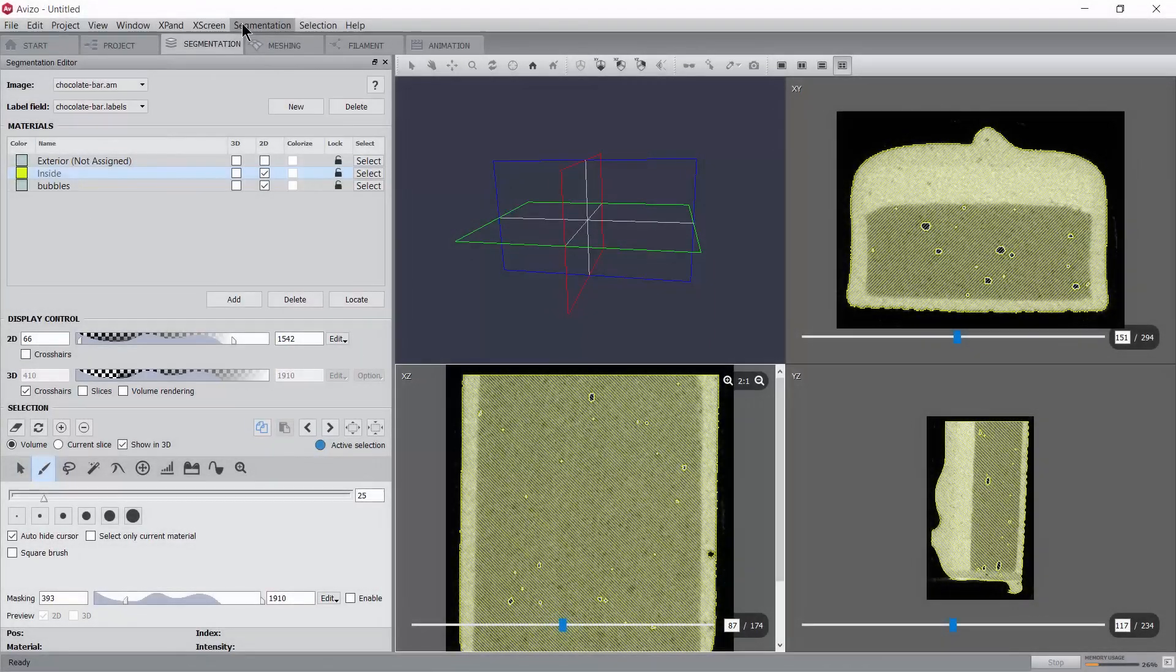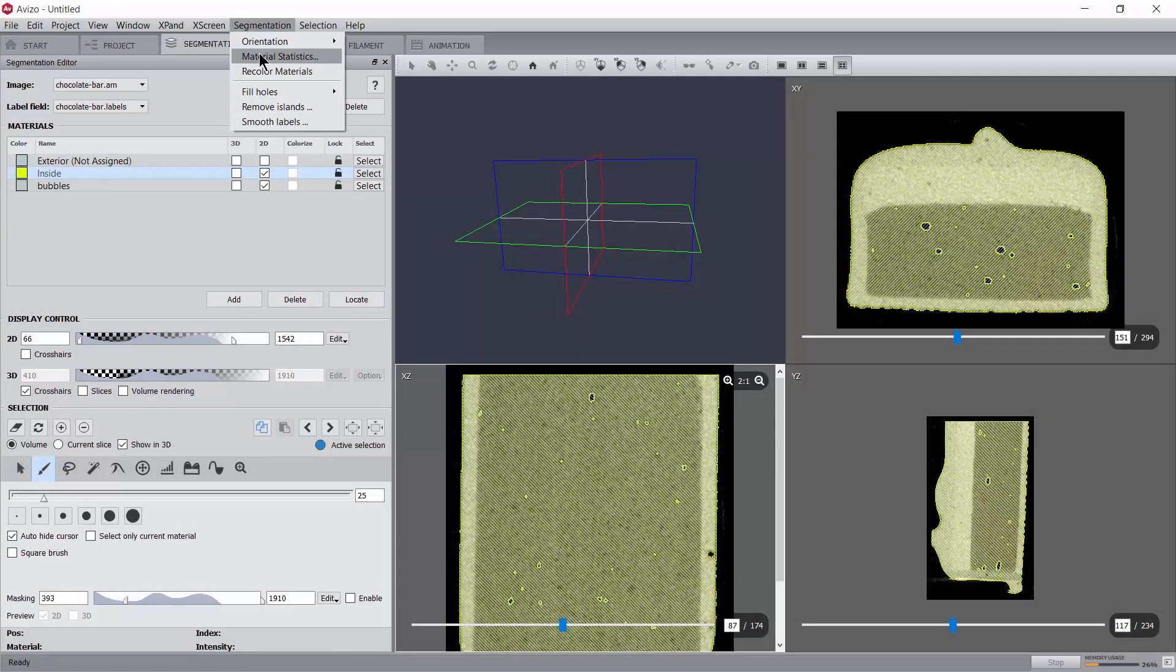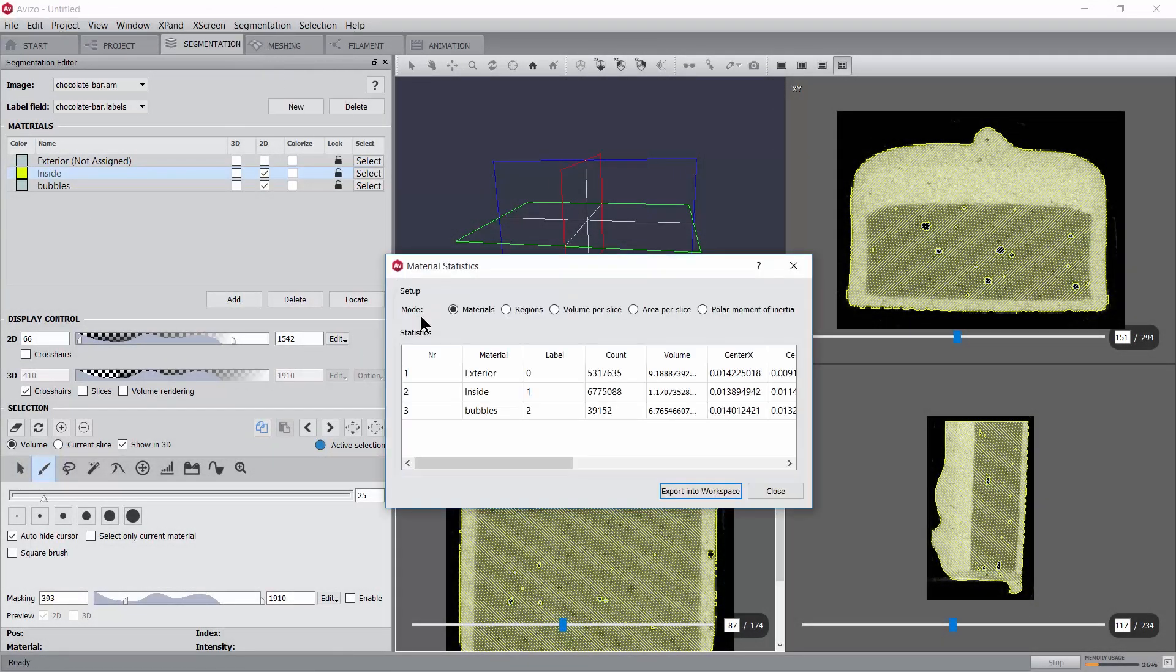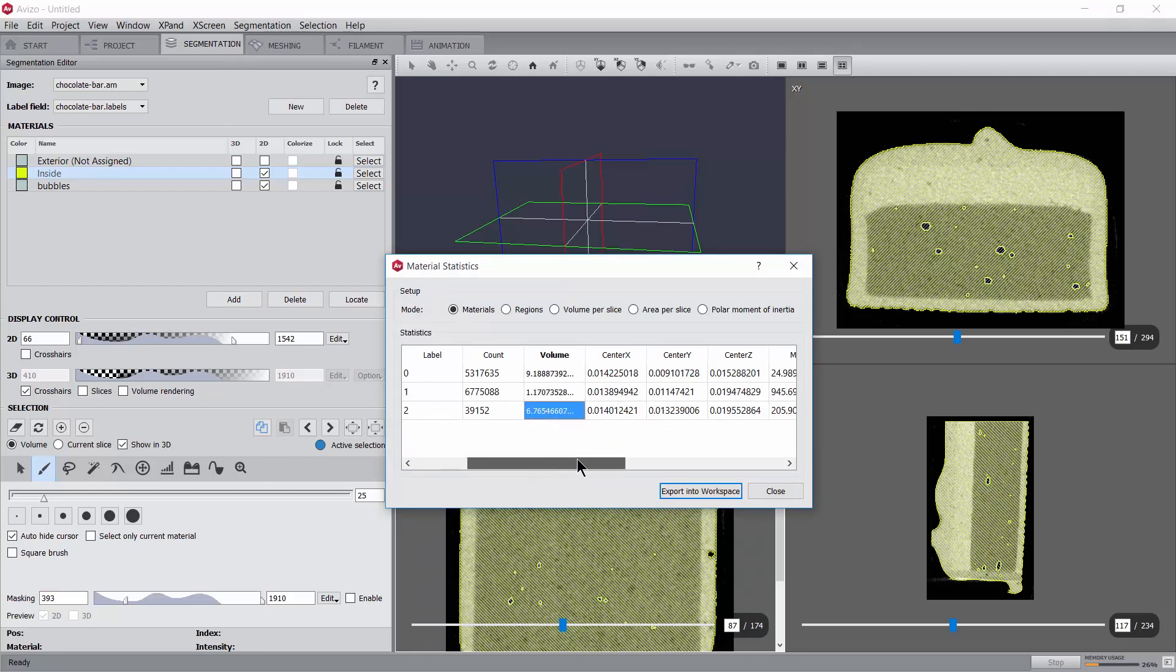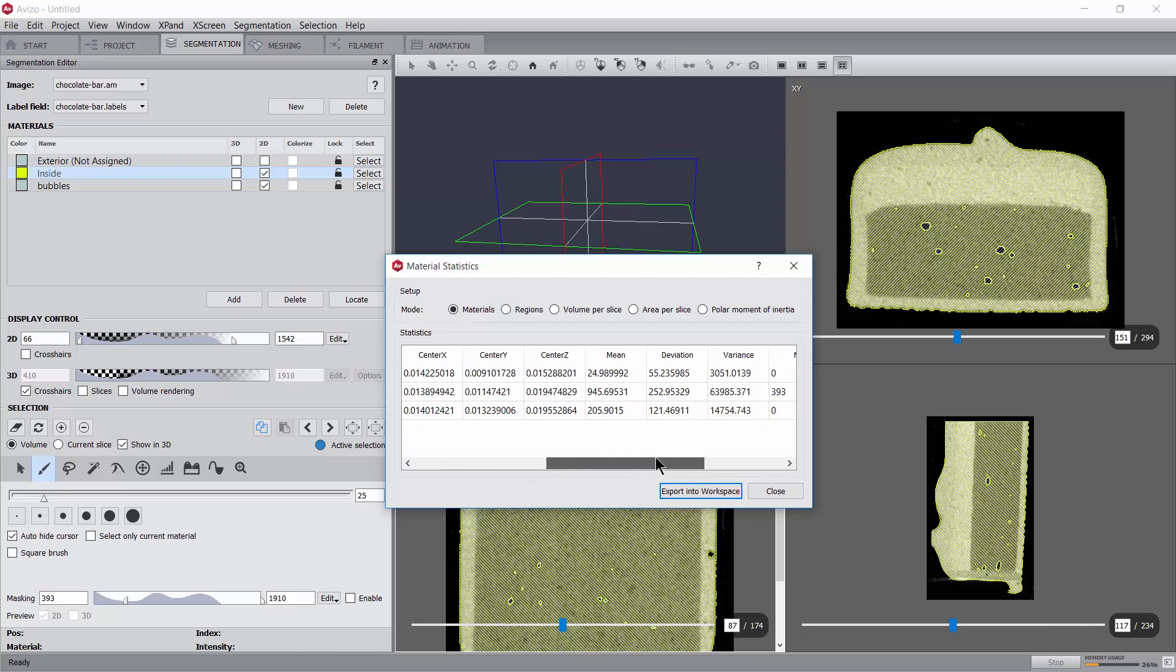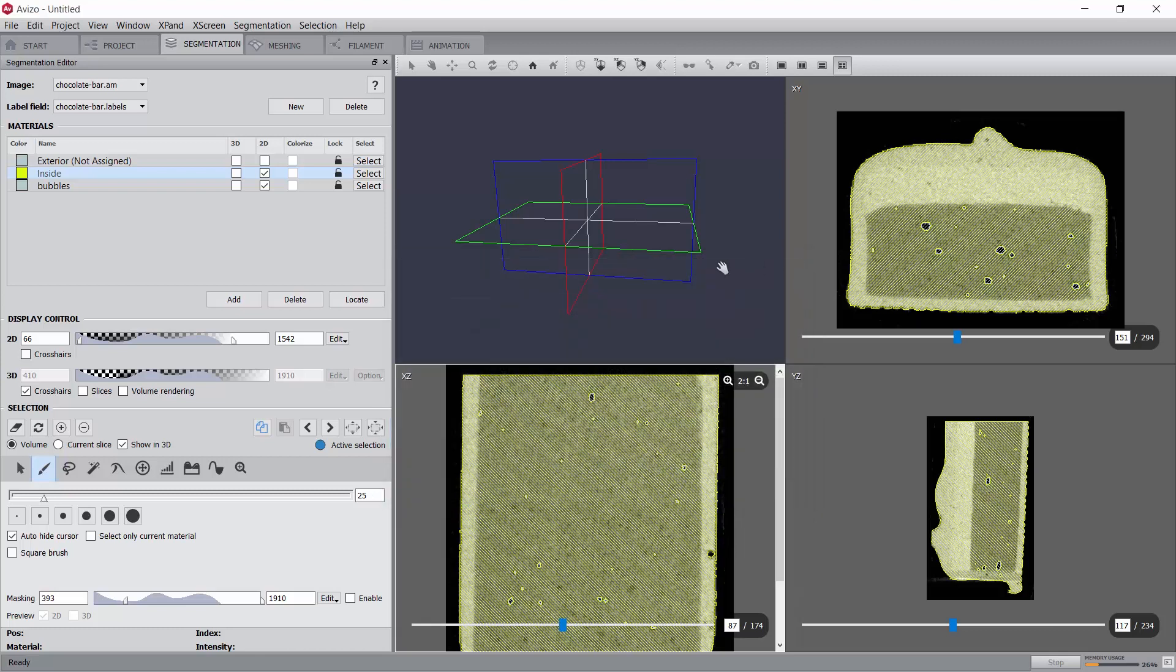At this stage, using the menu segmentation material statistics, we can already compute the volume of the chocolate bar and the amount of air inside it, as well as a few other basic measurements. More advanced measurements are available in other parts of the software and discussed in other tutorials.